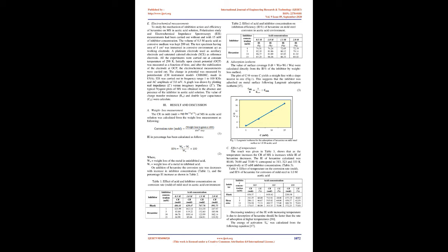towards most metals. Several approaches have been proposed to protect metal from corrosion. The use of inhibitors is one of the most practical methods for protection of metal against corrosion in acidic media. Most organic compounds having heteroatoms such as N, O, S, P in their aromatic ring or long carbon chain and having pi electrons were reported as efficient corrosion inhibitors under aggressive environments. Hexamine was reported as an effective corrosion inhibitor for different metals in various acids. In the present work, the efficiency of hexamine as corrosion inhibitor for mild steel, MS, in acetic acid media is studied by weight loss and electrochemical methods.